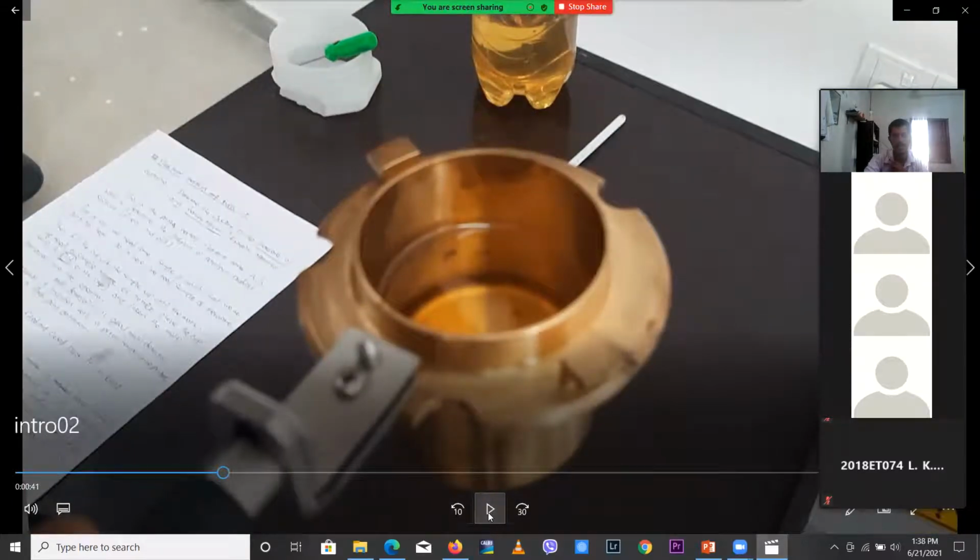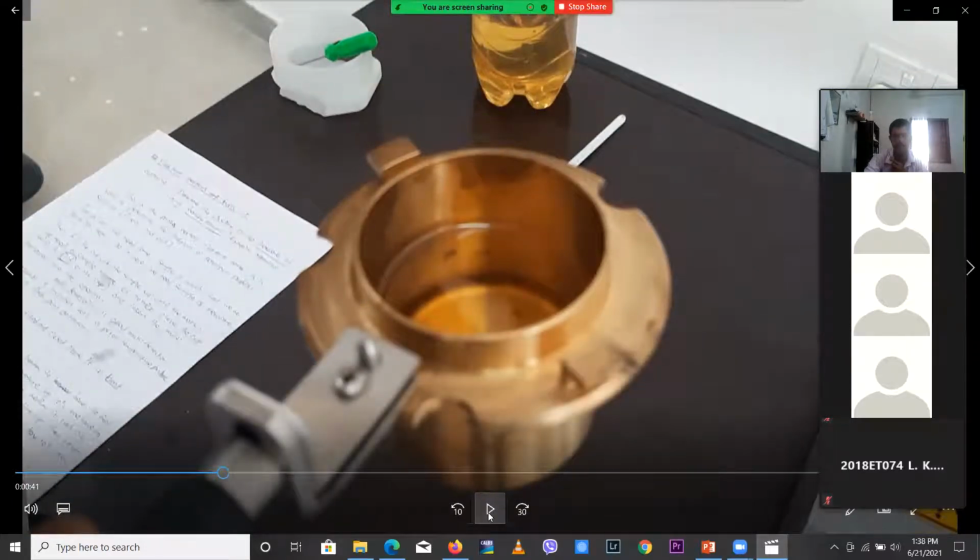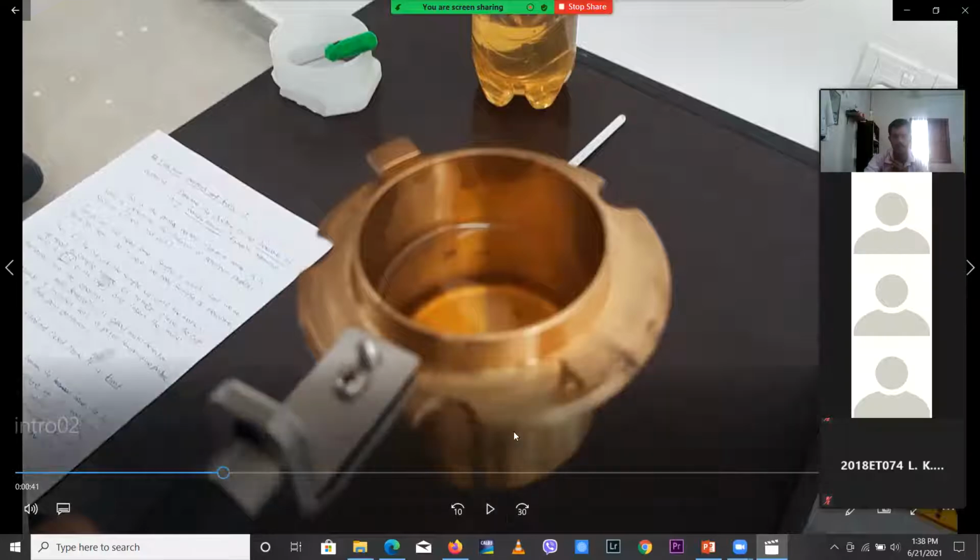By accident I explained it as copper, but it is made of brass, not copper. So these are brass.